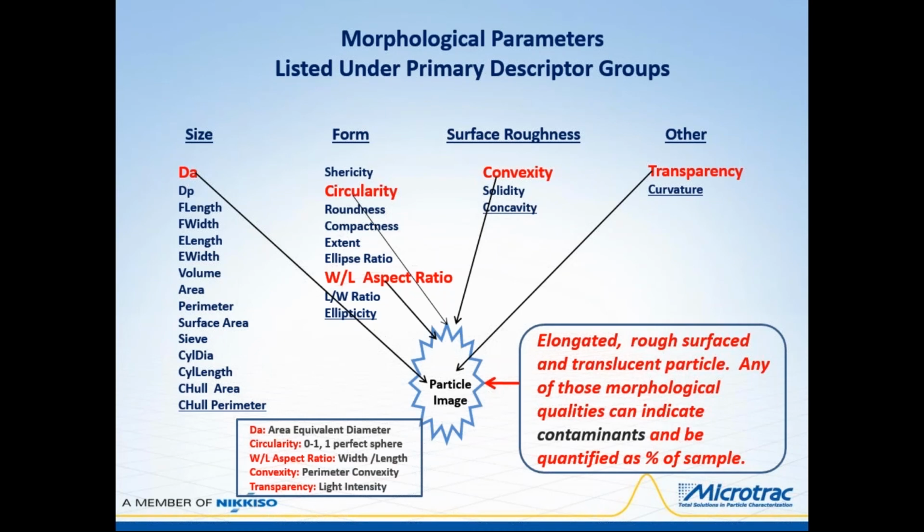dA, a size parameter, is the area equivalent diameter of the particle, which closely correlates to the equivalent spherical diameter reported in diffraction data. Circularity is a form parameter. On a scale of 0 to 1, 1 is a perfect circle. Circularity is affected by both surface roughness and aspect ratio. Note the particle image shown.